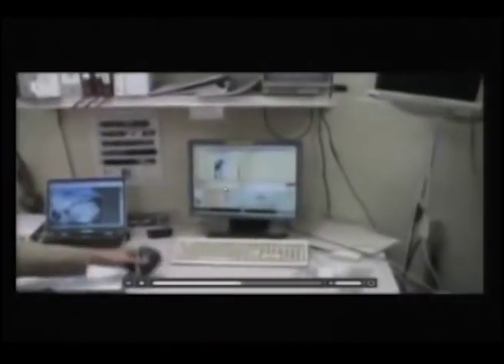And not only can we look at spectroscopy, as you can see in this particular lab which is using the ALS source, we also have scanning tunneling microscopy being conducted, specially on an isolated carbon nanotube. And here is a person working on carbon nanotubes, and the images are being seen here.